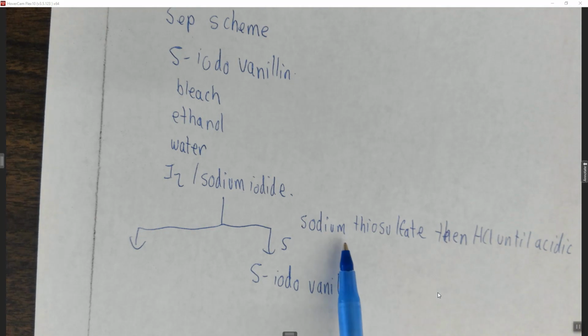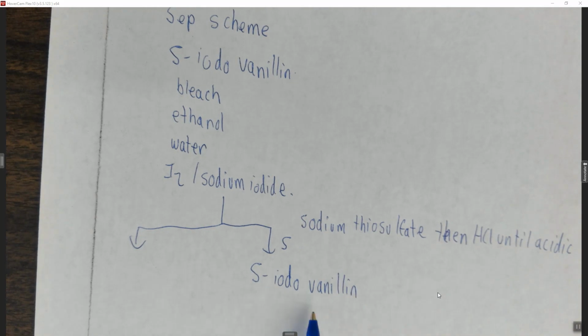All right, so remember that this compound is going to precipitate relatively quickly after the addition of the HCl, with of course the sodium thiosulfate before that. However, you still want to let it continue to precipitate for 10 minutes to make sure that you get a good yield. This reaction is all about being patient. It's not a super technically challenging reaction, but there are a couple of safety concerns, and you just have to be patient. You're adding things slowly, you're waiting as long as it takes, not necessarily as long as the lab manual says. In this case, the 10 minutes should be good, but in the previous case, you might have to stir for a little bit longer, as we talked about.